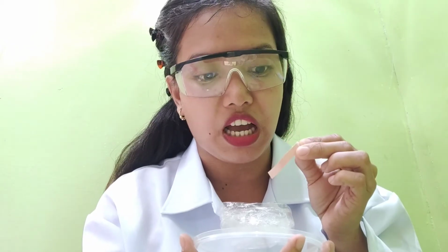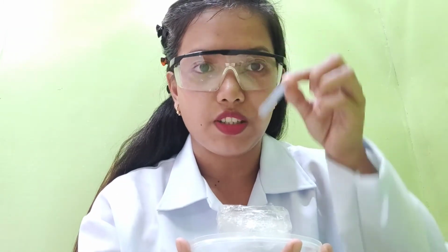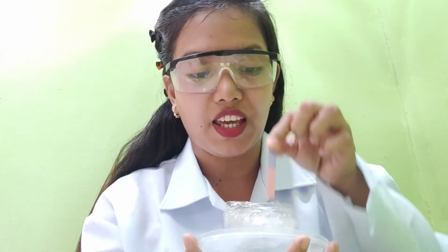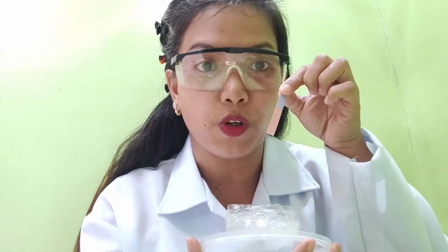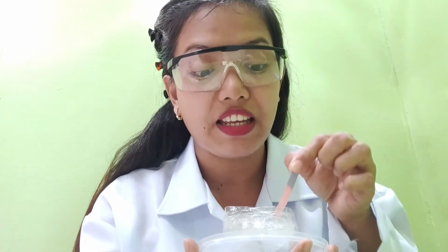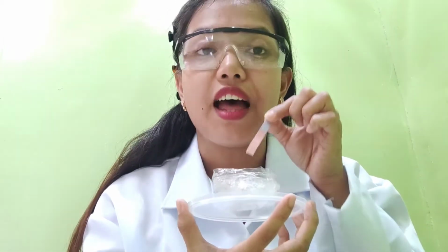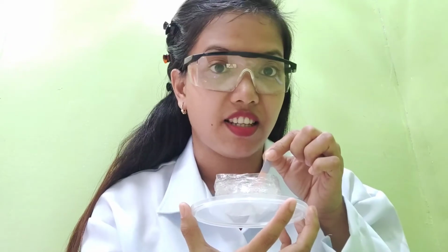Next, how about the blue litmus paper? Okay. So makikita nyo, ang blue na litmus paper ay nagiging red. Kaya ito ay isang acid. Again, vinegar is an example of an acid, not a base.